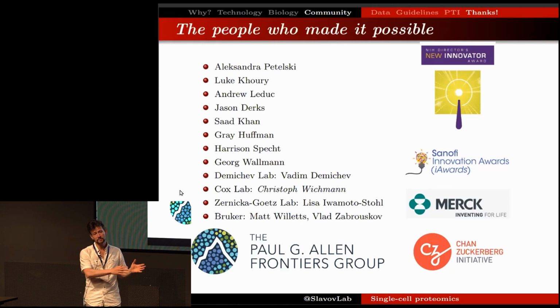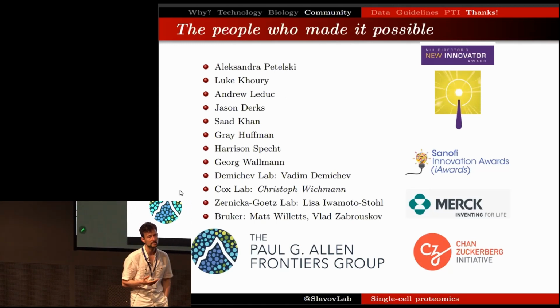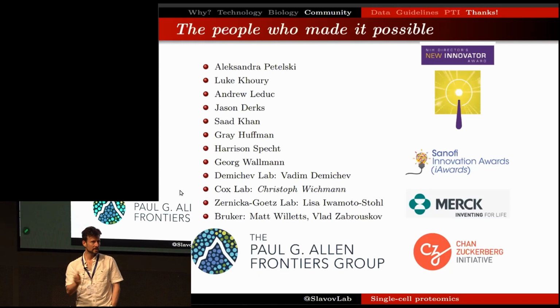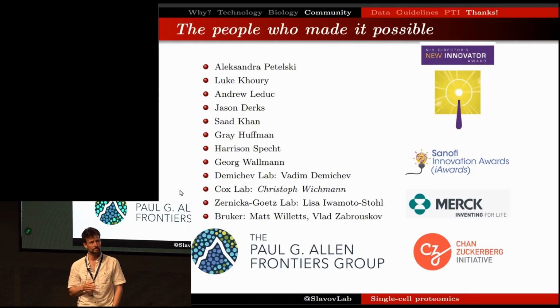And the best we can do is just propagate this through the entire pipeline and have the uncertainty being reflected in the final result. Show that whatever conclusion we have is robust to different assumptions about data missingness and different handling of the missing data. So one approach that we have used in a number of our publications is to apply different methods for imputation or no imputation at all, simply use only the observed values for the analysis, and then see if the main result that we interpret is observed and consistent with all of the different workflows for data analysis.